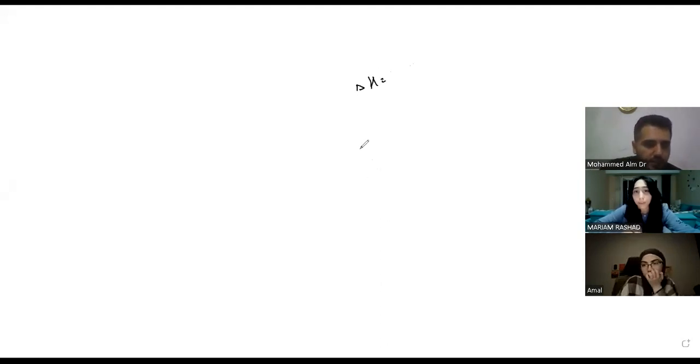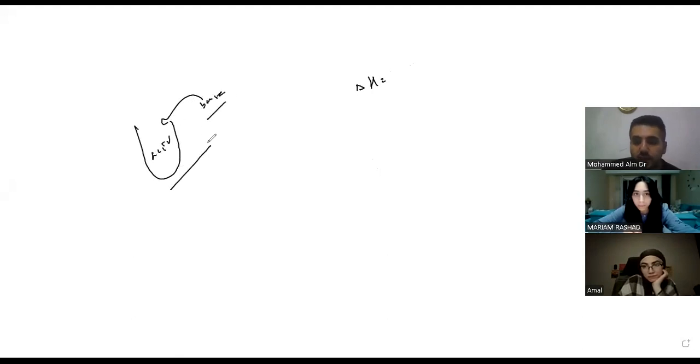For the previous experiment we did, the neutralization, when we mix the acid with base, this reaction was less exothermic than expected in the book. Why is that? Can we also say heat loss? Conditions were not standard? Amazing, heat loss.